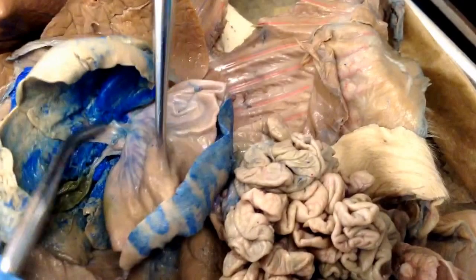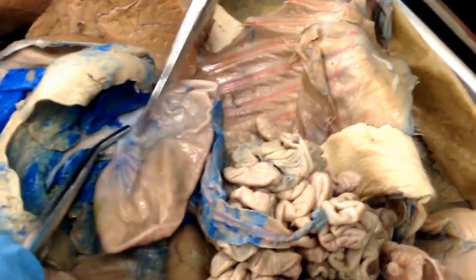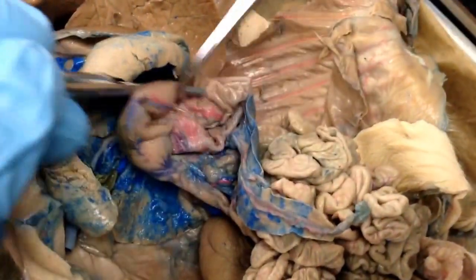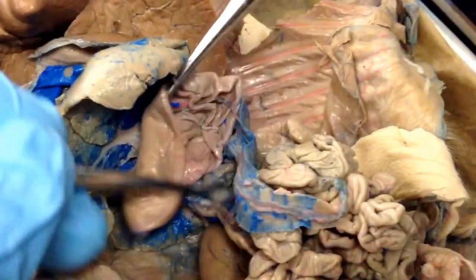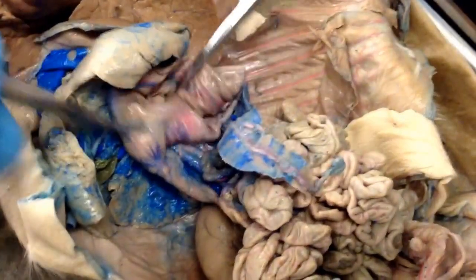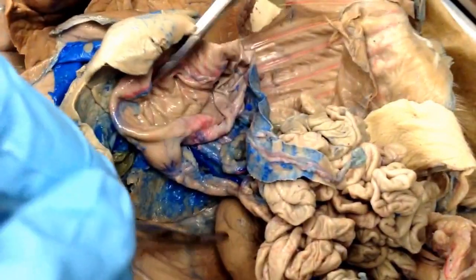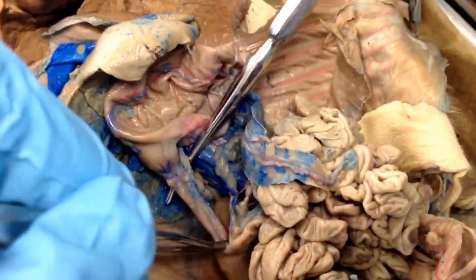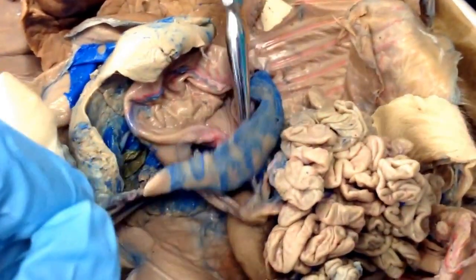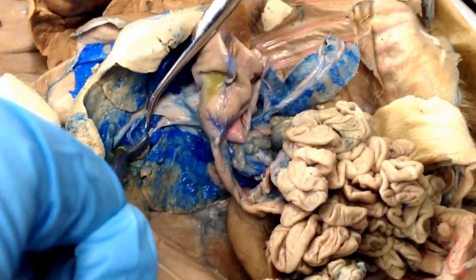Okay, so the esophagus right there leads into the stomach, and right there's a hard thing. That's the cardiac sphincter, and up in the top of the stomach is the cardiac region. The central area of the stomach, the middle area, that's the fundus. And then right there, that hard thing is the pyloric sphincter, and that's the pyloric region. And this leads into the duodenum, the first part of the small intestine. That right there is the spleen. That's the gallbladder. And that is the cystic duct.